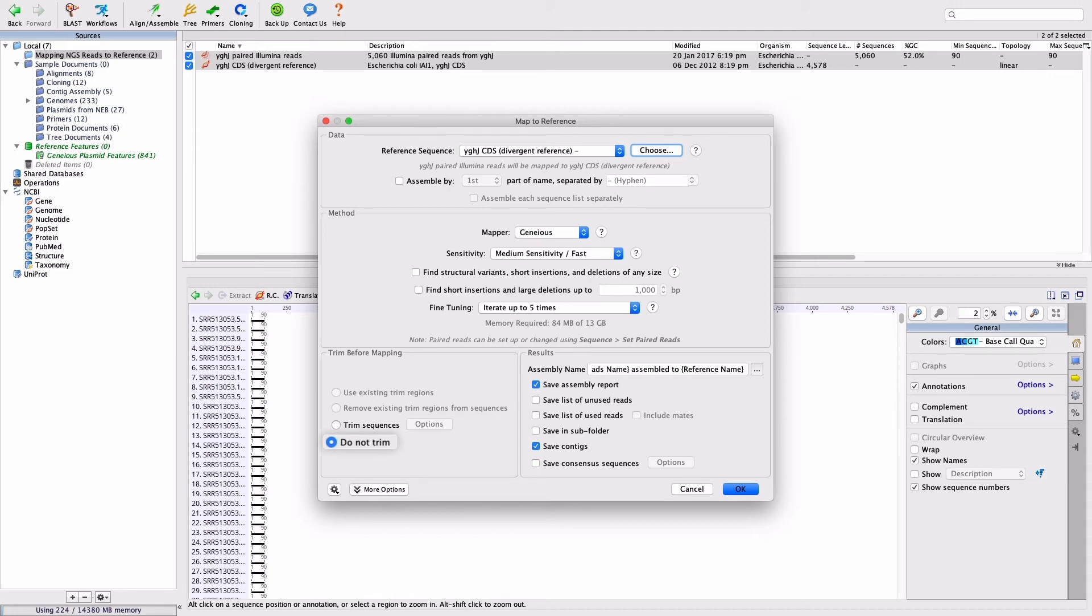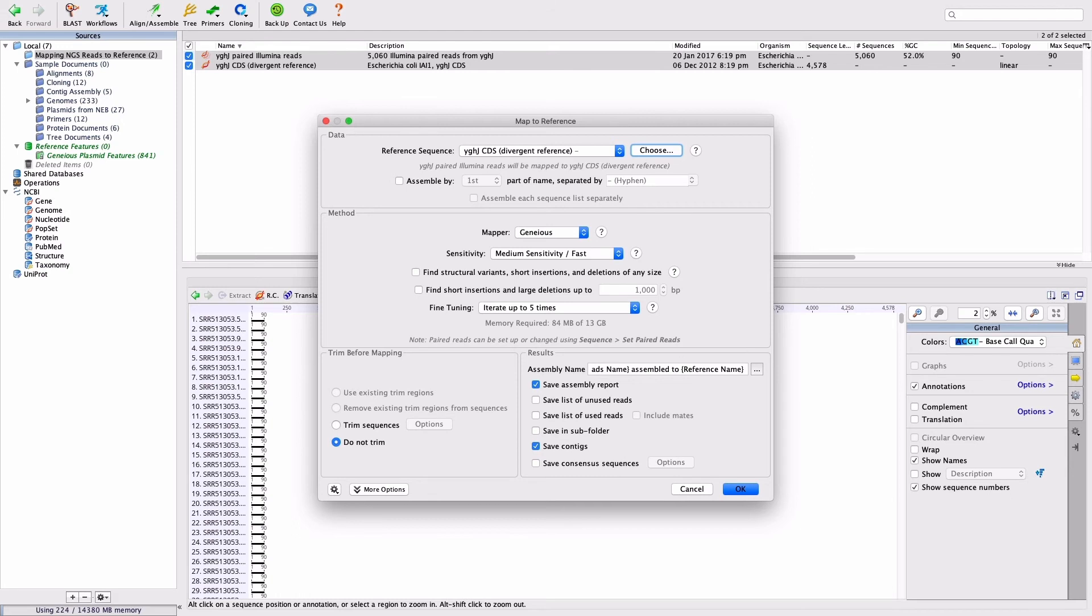Ensure Do Not Trim is selected, and under the Results panel, choose Save Assembly Report and Save Contigs, but uncheck Save in Folder if this is selected. Your mapped reference options should now look like this. Click OK to run the assembly.